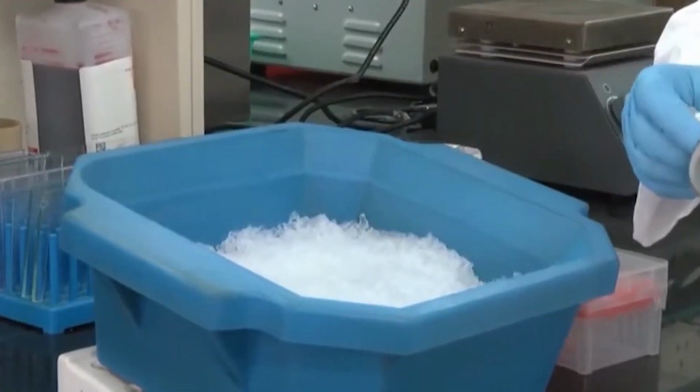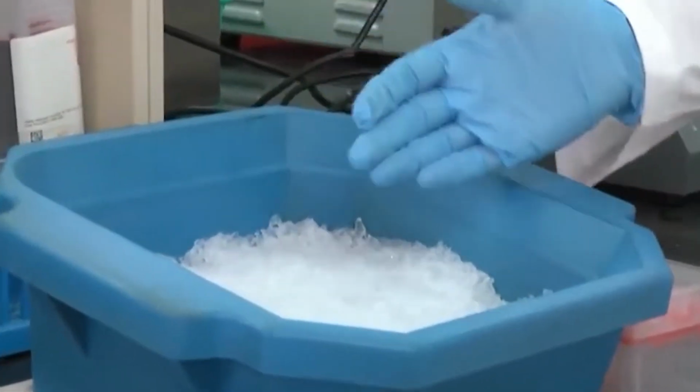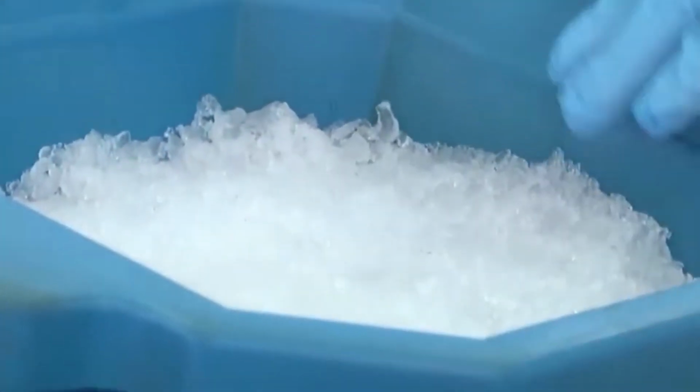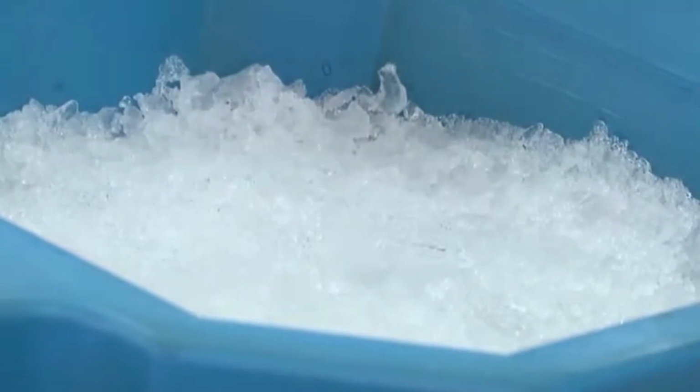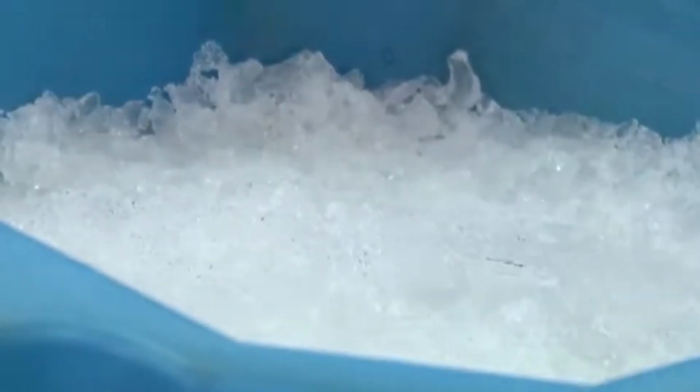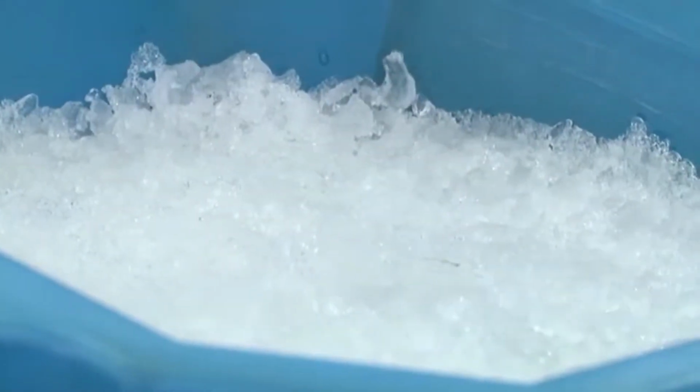This vial contains 50 microliters of competent cells. So, it depends on how you have prepared, how many aliquots you have prepared. A couple of weeks earlier, when I prepared these competent cells, I had made maybe 100 aliquots of 50 microliters each. You can make smaller aliquots and increase the number of vials you have, or vice versa.